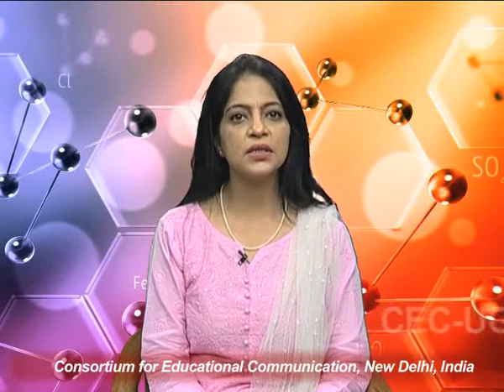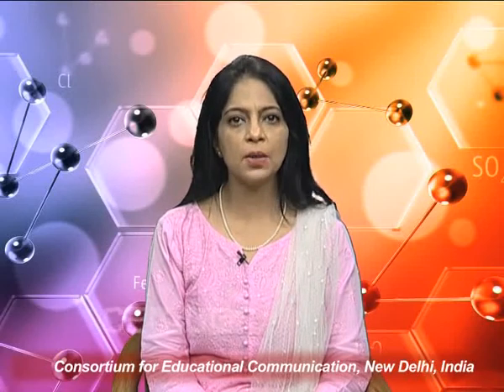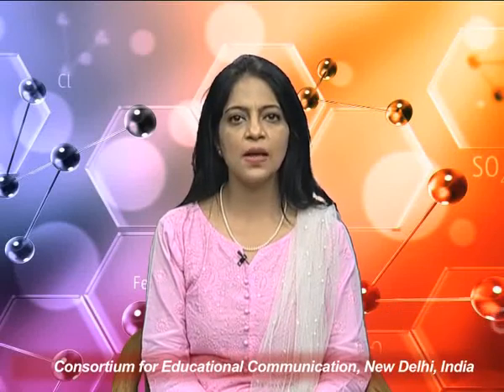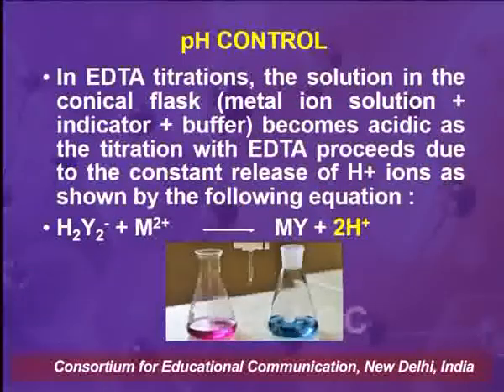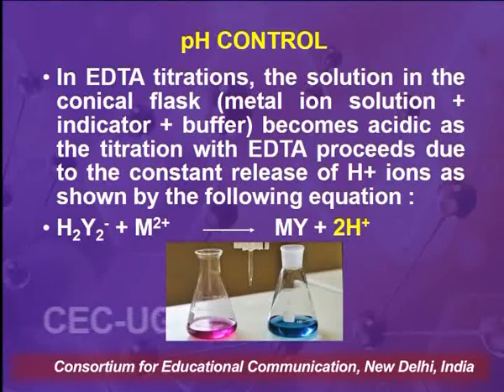The volume of EDTA consumed in this titration gives the amount of magnesium ions present by a set of calculations. And as we have just seen, the color of the solution changes from red to blue, wherein the red color is due to the magnesium indicator complex and the blue color is due to the free indicator. The complex which has formed, that is the magnesium EDTA complex, is colorless. So the blue color is due to the free indicator and not due to the metal EDTA complex.